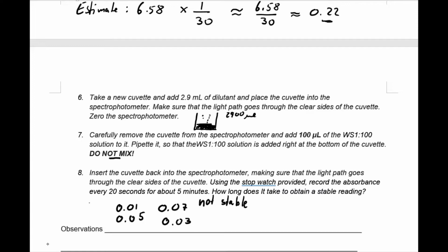We will see some kind of diffusion happening here. So here is a lot of diffusion, and we are basically measuring just simply diffusion, but not a homogeneous mixture of our substance. And that, of course, is very problematic, because we are just basically measuring random numbers.